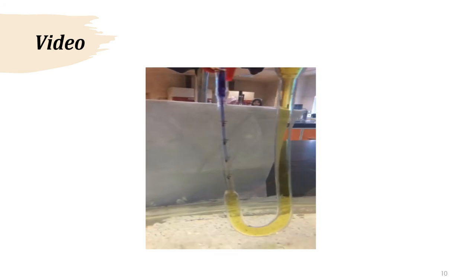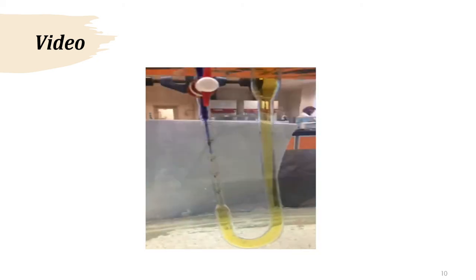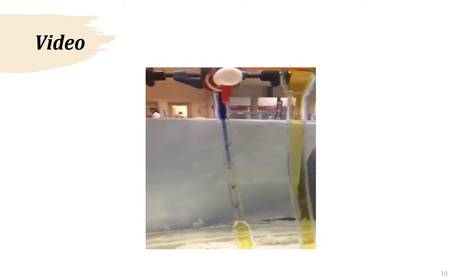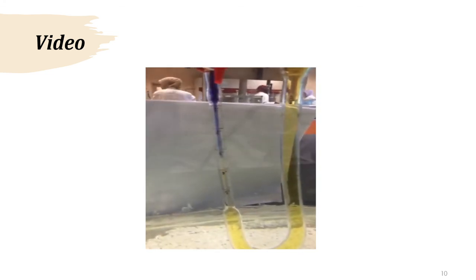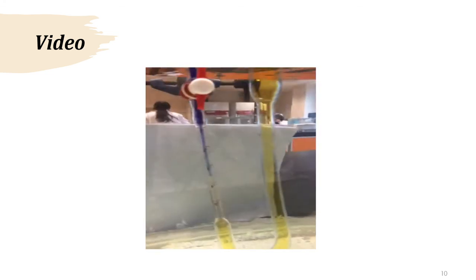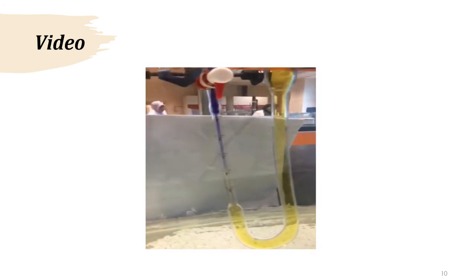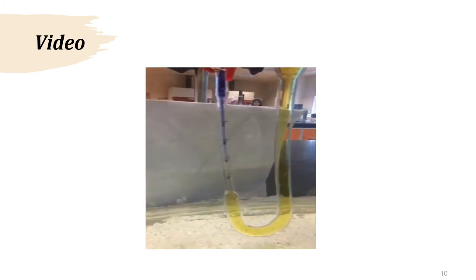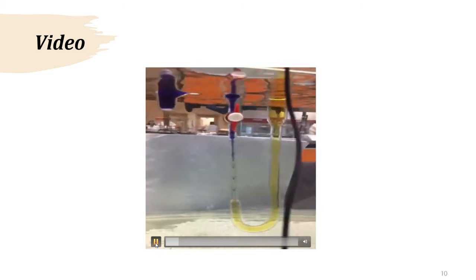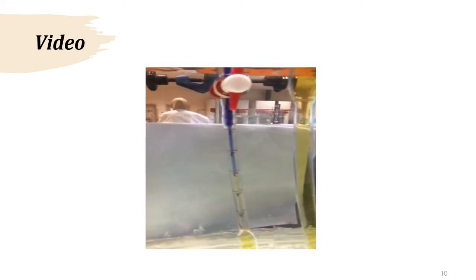Then in this experiment you are also asked to reverse the wires, as you can see in the lab manual, where you swap the positive to negative, negative to positive, and you will see that it will go up in the reverse direction.